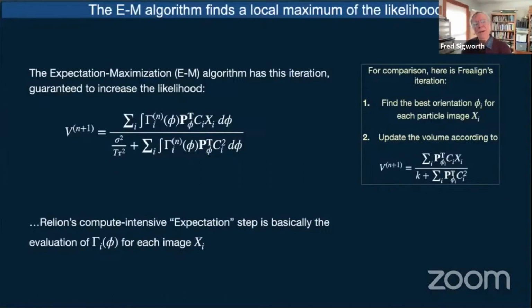But if you want to tweak the reconstruction some and say, well, I want to weight the data more, I will push things with the possibility of overfitting, then I can put in a large t value, which makes this regularization constant smaller, and we get closer to the situation where we have a true deconvolution. Okay, I hope that answered the question.